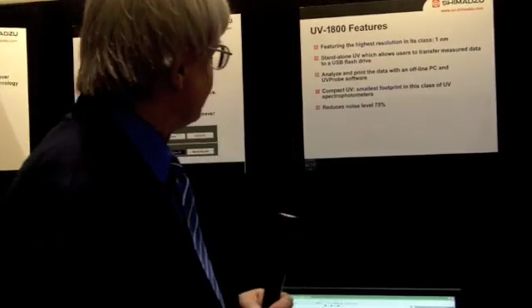Hi, I'm Tim Stutt, editor-in-chief of Laboratory Equipment Magazine, and we're at Shimadzu's booth at the ACS National Meeting in Boston. We're with Nalina Jobe, and she's going to tell us about Shimadzu's UV1800.